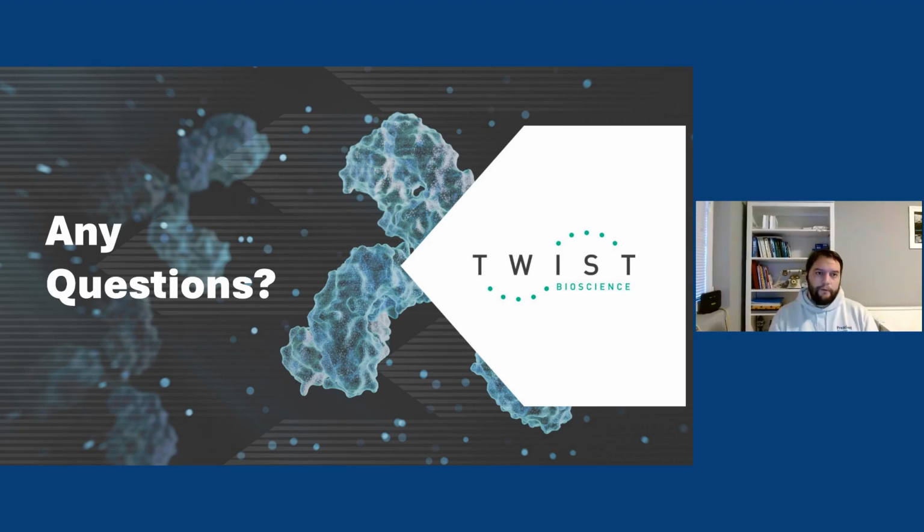So the first question we've had is, what were some of the key challenges in integrating wet lab data with the machine learning models during iterative optimization? Yes, so I would say there was a challenge before that. That was basically first gathering all the historic data so that we can have some initial set of models.